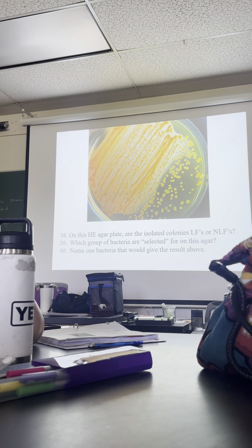Alright, here is Hektoen enteric agar also. What's the reaction of these colonies? Lactose fermenter. That's all I'm looking for. You can't say lactose positive or lactose negative. I prefer you say lactose fermenter or non-lactose fermenter. Okay?